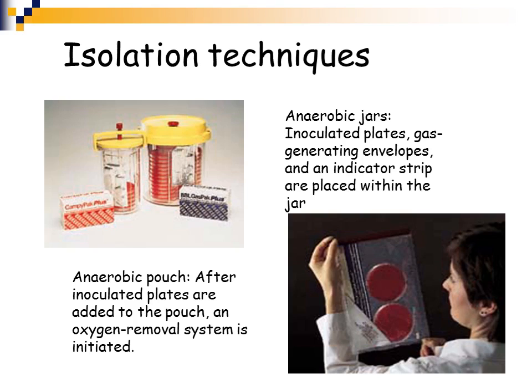Now, there's also pouches, and these anaerobic pouches, you can see on the right hand side, bottom, are very similar to the microaerophilic Campylobacter pouch. If you were working in a lab and you rarely did an anaerobic workup, or you only had a couple of plates, you might use the pouch system. The pouch system is just like the Campy microaerophilic system, where you put your plates in the bag. It comes with a little liquid plastic container. You squeeze all of the liquid into this little slot in the plastic area that goes all the way down into the sachet in the pouch, and when the liquid goes in, it generates the gas and removes all the oxygen, and you have to close that bag very nicely. There's a special system to close the bag, like a clip.